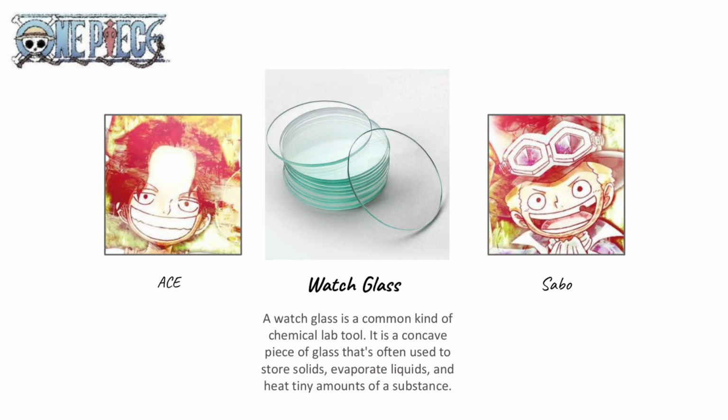Watch glass. A watch glass is a common kind of chemical lab tool. It is a concave piece of glass that's often used to store solids, evaporate liquids, and heat tiny amounts of a substance.